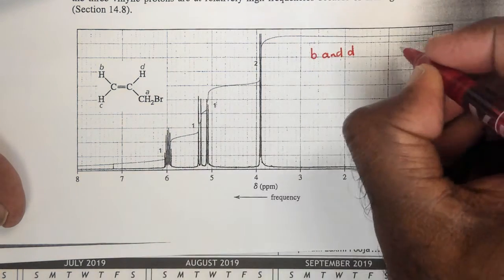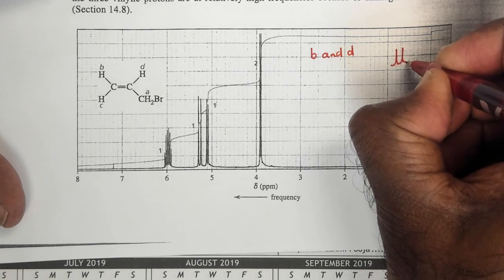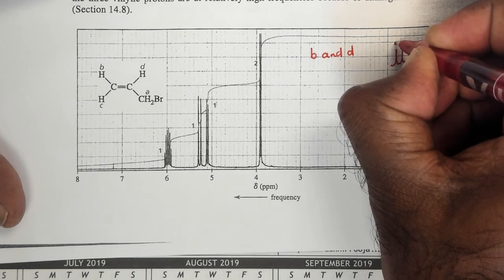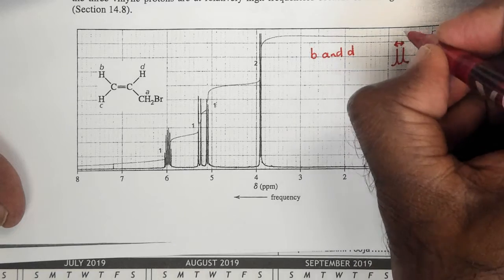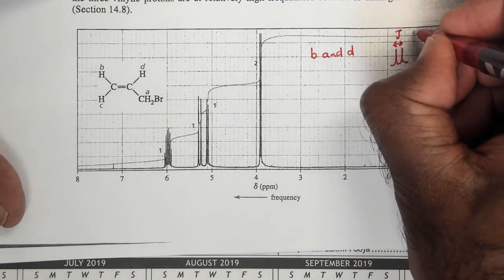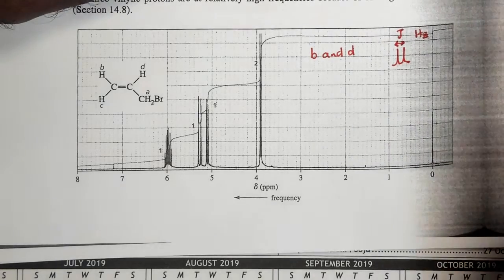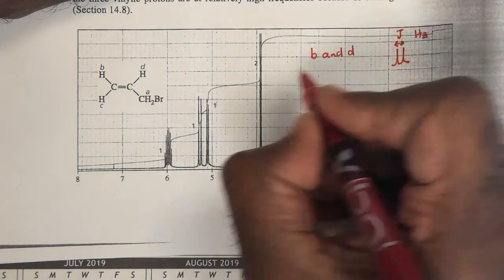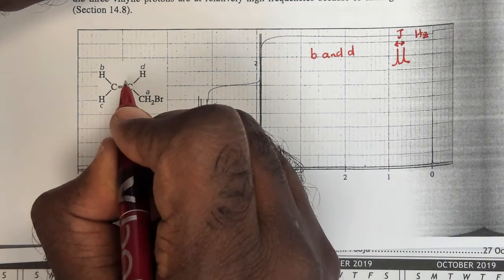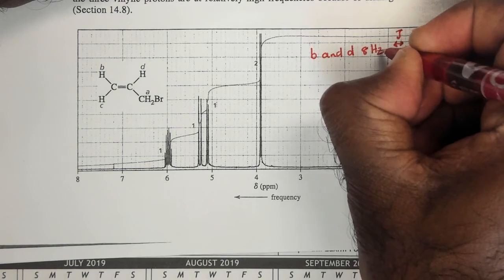So if I have a doublet like this, the distance between the peaks there in Hertz, we give a coupling constant called J. So in B and D, the coupling constant for cis protons on a double bond is normally about 8 Hertz.